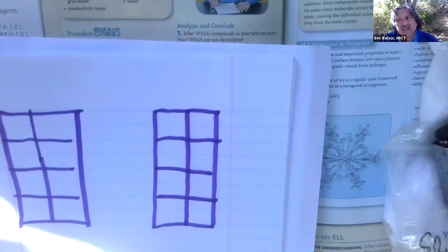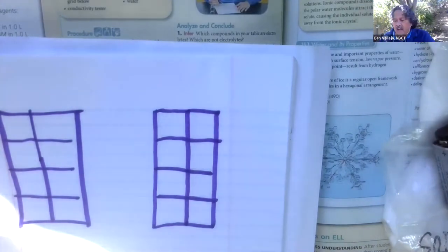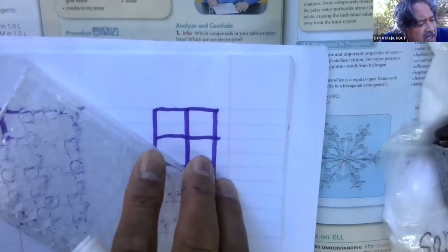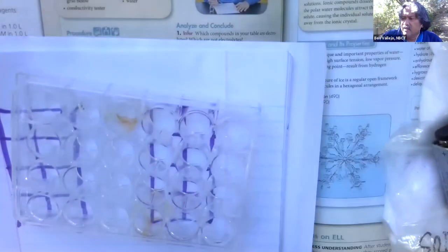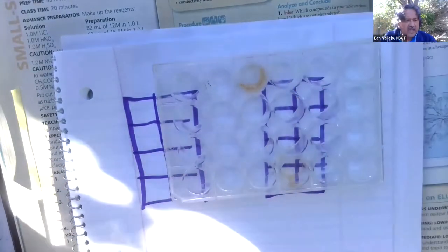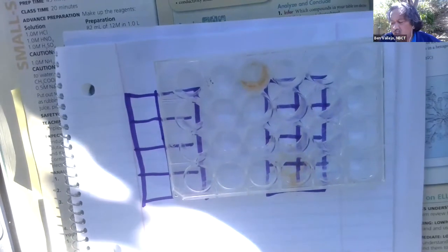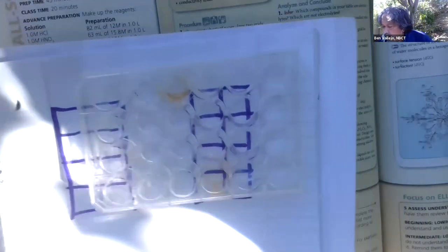All right, so the reaction surface can be a piece of plastic. It could be like an empty Ziploc bag. Or if you have your kit, and I do, I got these things, right? To give myself a little more room to work, I'm going to use that one. Okay. So there's a reaction surface. What do you call those plastic things you put in your binder where you put a piece of paper in it, and it protects it? It's called a sheet protector. You could use a sheet protector as a reactive surface as well. Okay, let's see, what else is there?